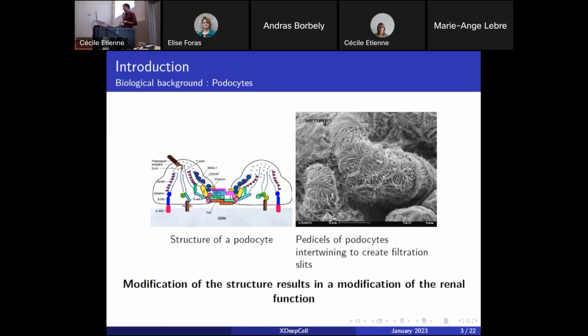So we went to study one of the components of the cell, the actin, mainly because it is situated everywhere in the cell, and this will help us on the image acquisition. Sorry, I'm kind of lost, but we focused on the actin in the following work.